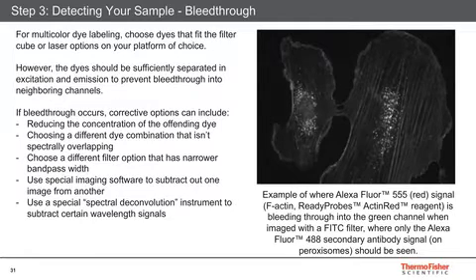Now realize that you can sometimes have a problem with bleed through. This is where, let's say you have a green fluorescent dye, like Alexa Fluor 488, and an orange-red fluorescent dye, like Alexa Fluor 555, or Cy3. This might be where one dye bleeds through into the filter of the other dye, such that you see a signal. What can you do?